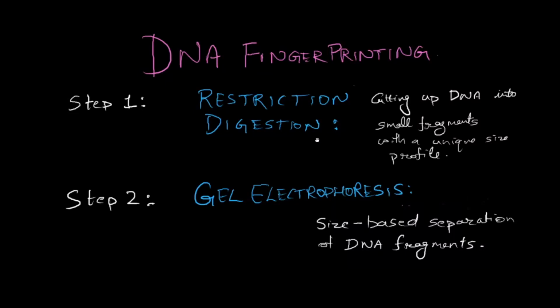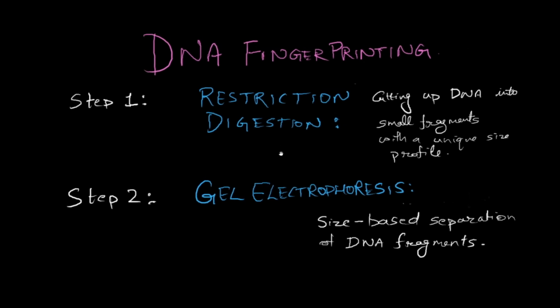Okay, hi everyone. So we previously spoke about the possibility of using DNA fingerprinting to identify individuals based on DNA samples, and we talked about how the general strategy involves at least these two steps. There's more to it. We're going to talk about that today, but it at least involves these two steps typically. At least this is how it was conventionally done back in the 1980s.